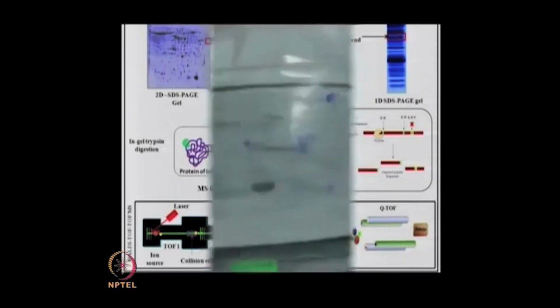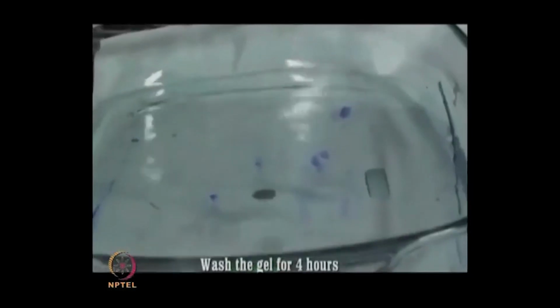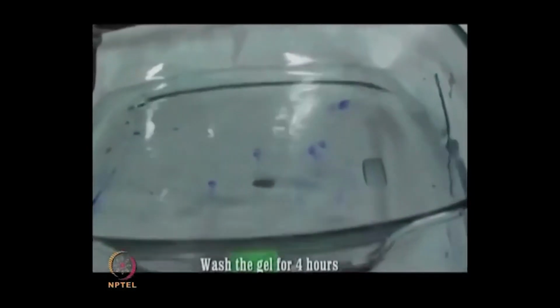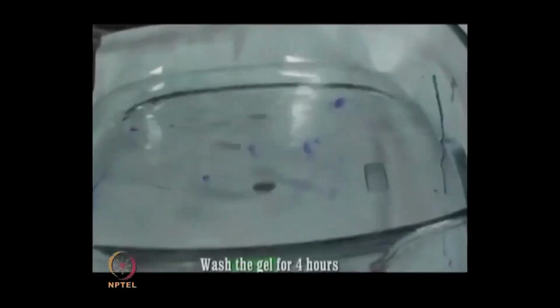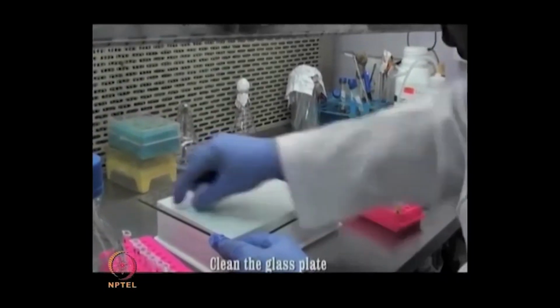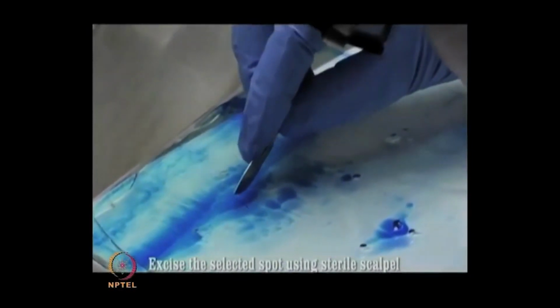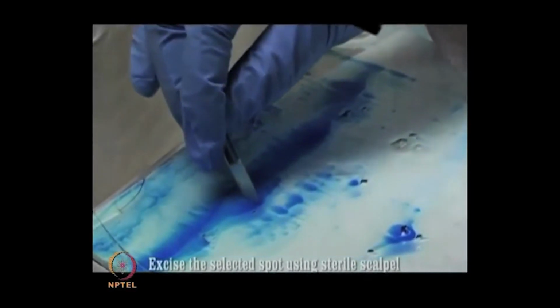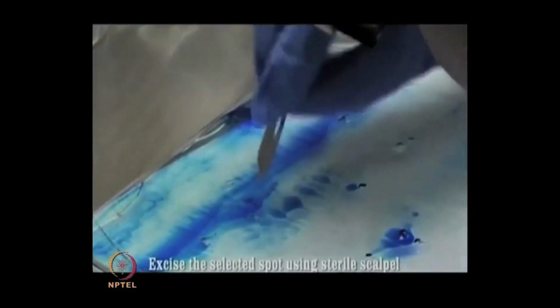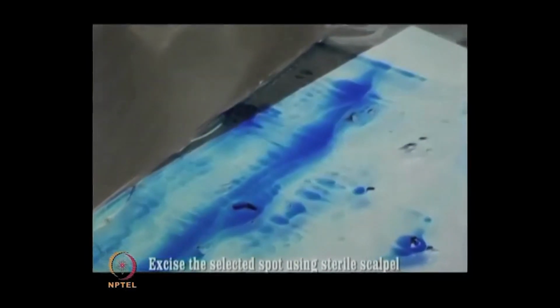So, let us say you have run a gel. First of all, you need to rinse the entire gel with water for a few hours with intermittent changing of the water. Now, you would like to excise the band of interest or the spot of interest. So, keep a glass plate inside a laminar hood and clean the surface carefully. Excise the protein spot with a clean sterile scalpel and place the gel slice into an Eppendorf tube.